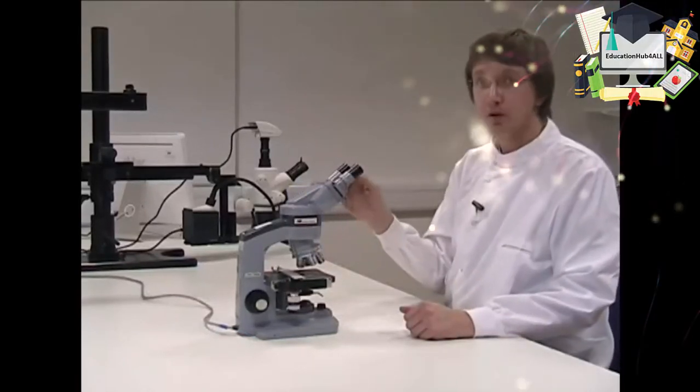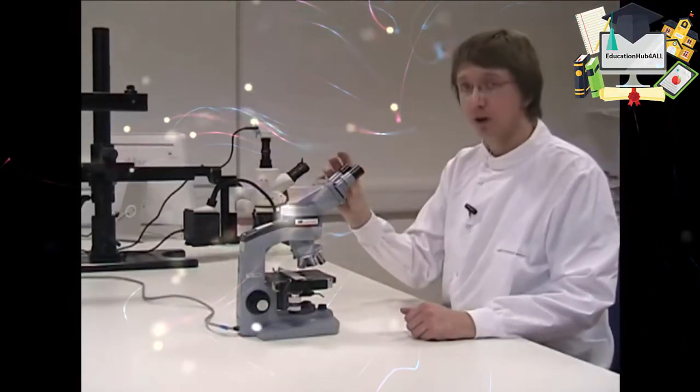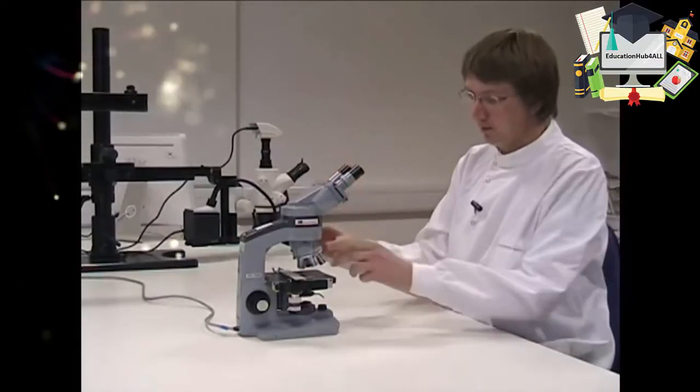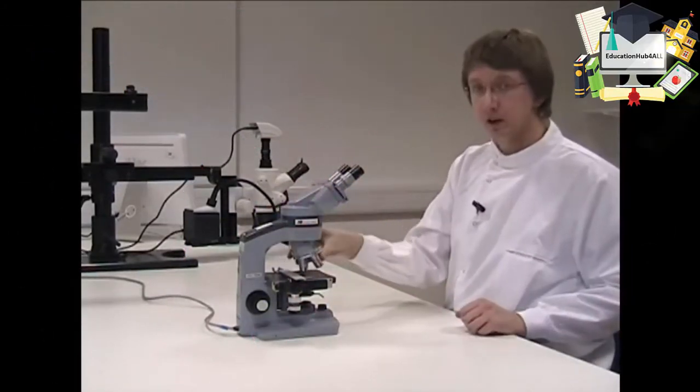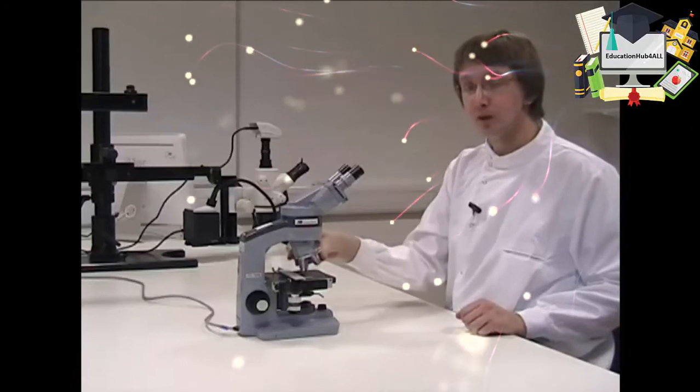So let's start by looking at the components of the microscope. At the top you have the eyepieces. Below them are the four objective lenses. Each of these lenses magnifies the image by a different amount.